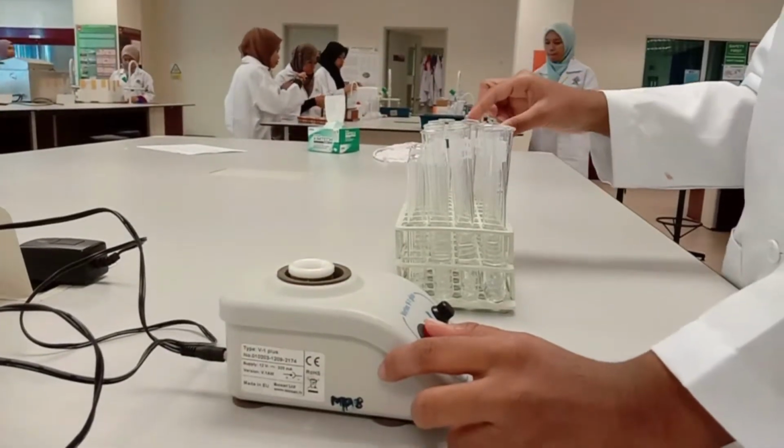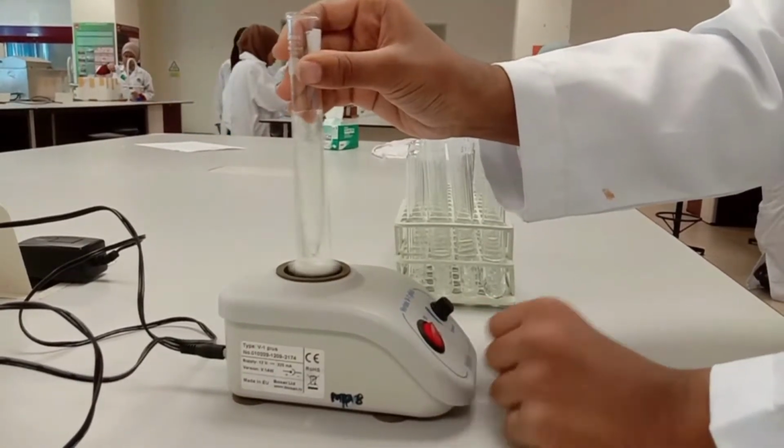All of the test tubes were shaken using a shaker until the solution dissolved.